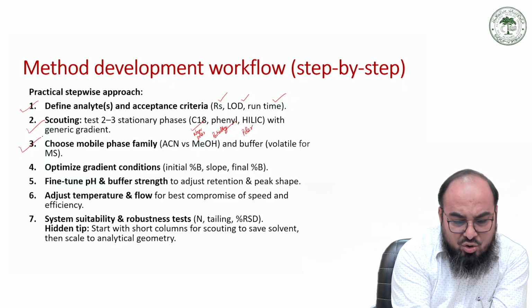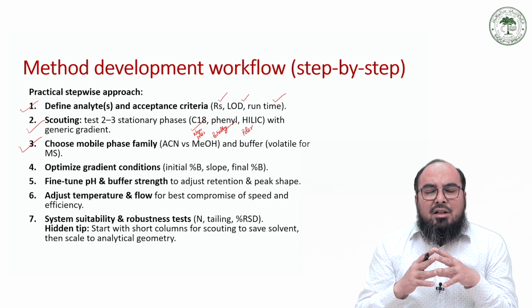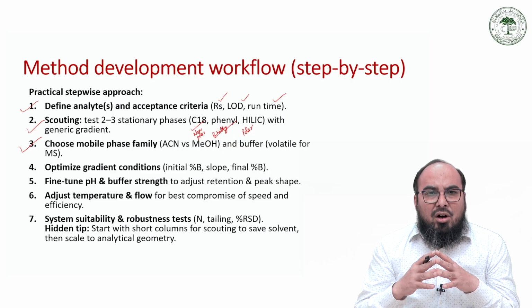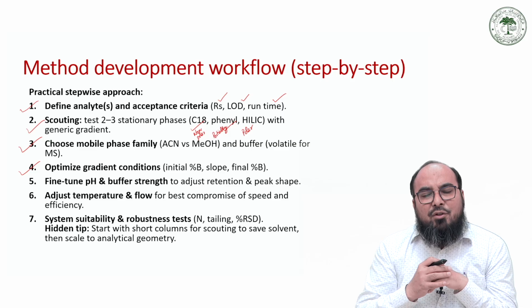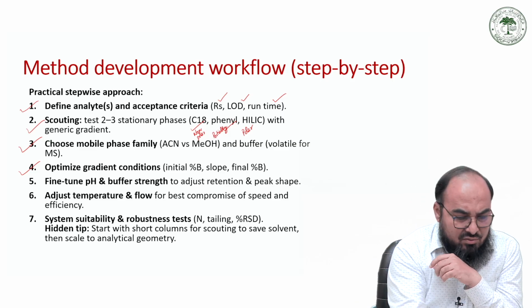Similarly, you have to choose which type of mobile phase it actually requires, what your viscosity requirement is, and if you are using buffer, whether you want to use the volatile buffer or you can be good with a non-volatile one. Similarly, you have to optimize the gradient conditions also, and fine tune your pH value and also the buffer strength.